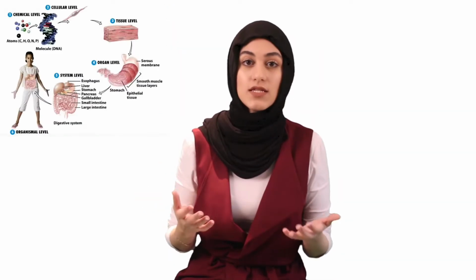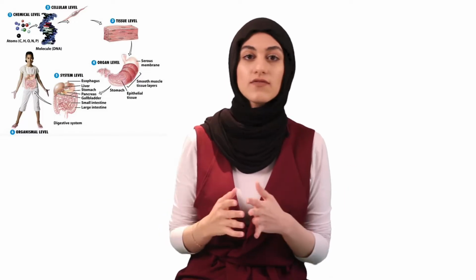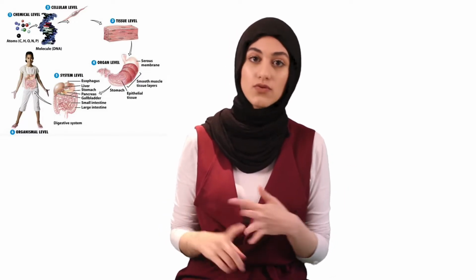But first, what is histology? When was it discovered? How do we use it? Why do we use it? And who uses it? Histology is the study of microscopic structures of tissue. So basically, we study tissues up close and personal. It's achieved through microscopes, different tools, and a series of steps that we will be further discussing later on in this video.